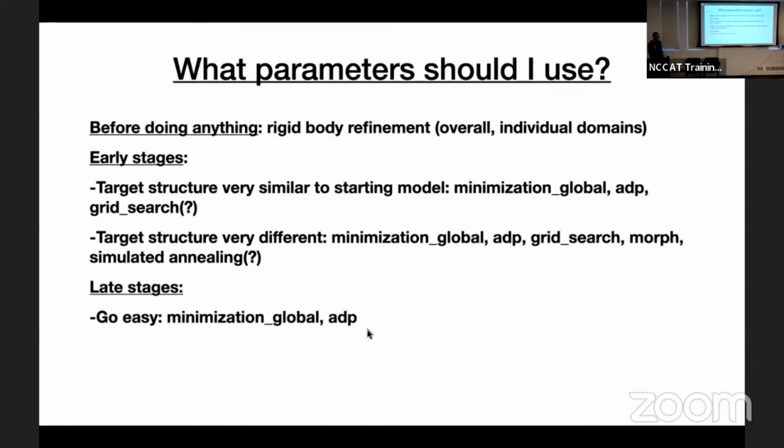And that's really just because, getting back a little to your question about, say, if you have weak density for a side chain, if you have weak or no density for a side chain and you turn on grid search, every time you do refinement, it's going to try to sample all the different rotameric states of your side chain and change them, right? And at some point, you may have positioned a side chain to minimize clashes with neighboring residues. You might have positioned it because that position makes good chemical sense, right? So it could be making a salt bridge with a complementary charge nearby, or maybe some hydrogen bond. If you turn on grid search, all of those carefully positioned details you've done will just get scrambled again.